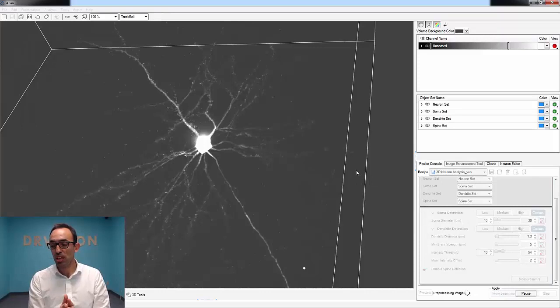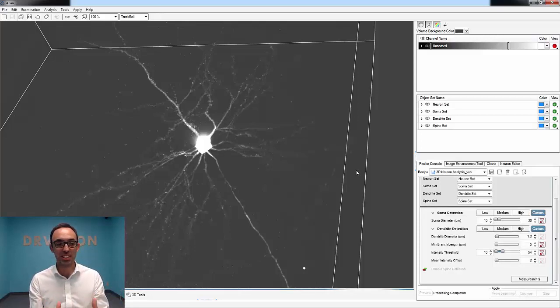reasonable results. So I just started it now, and on a data set like this, if your computer is doing just this, it will take something like 25 seconds. Today, it's likely that it's going to take around 40 to 45 seconds, because we have many things hooked up to this computer right now. There's 2 webcams, we're streaming live, and so it's a little bit more resource deprived right now.